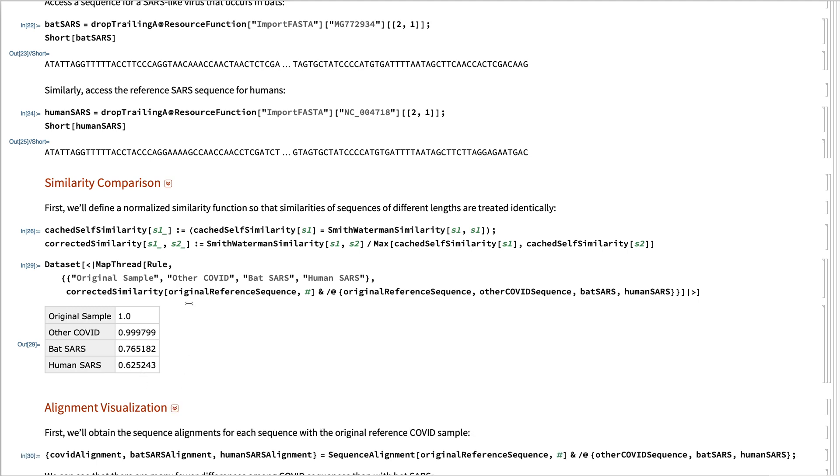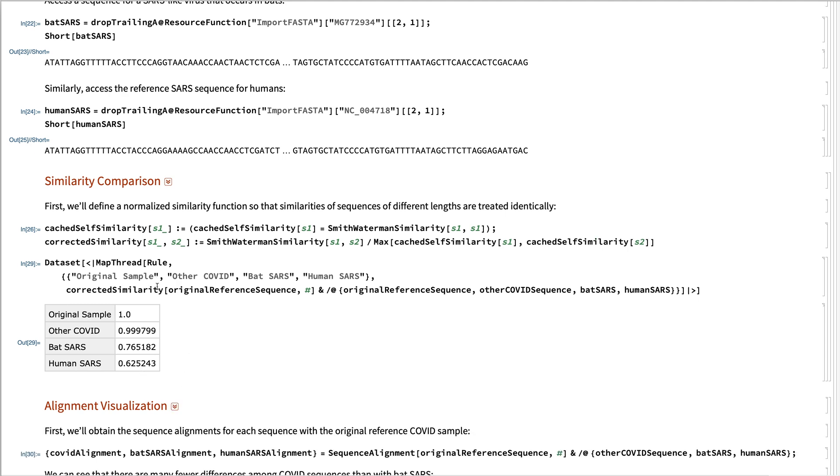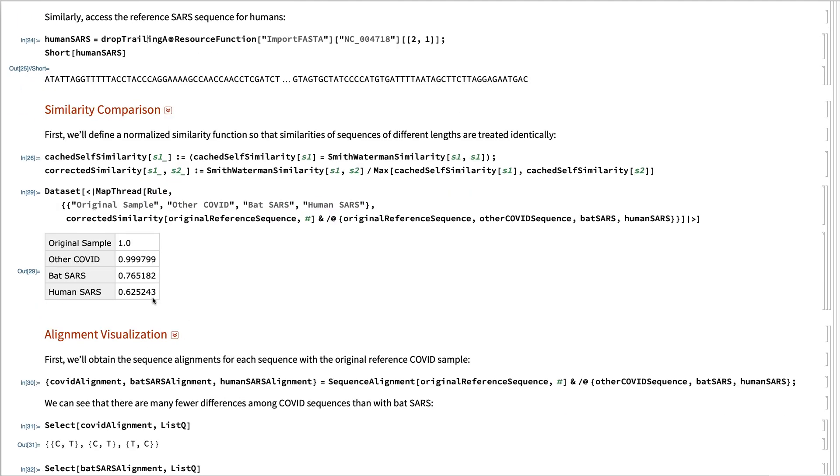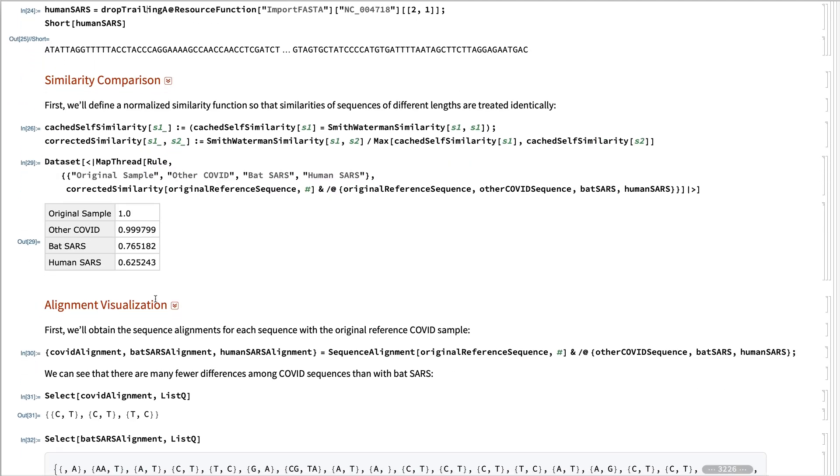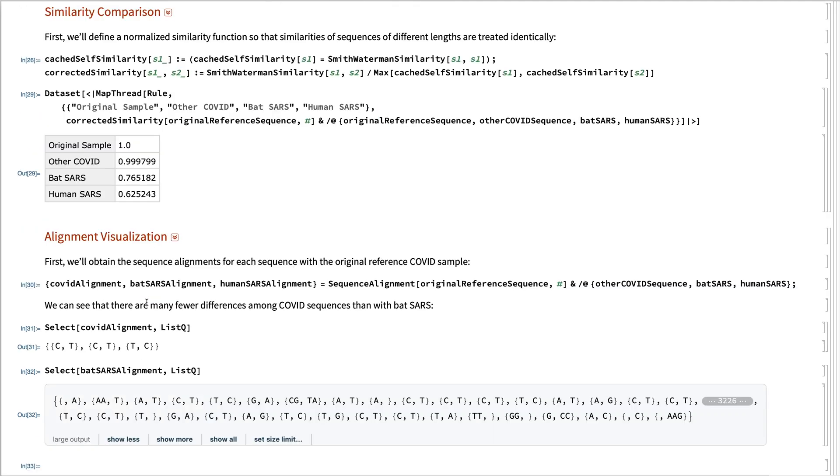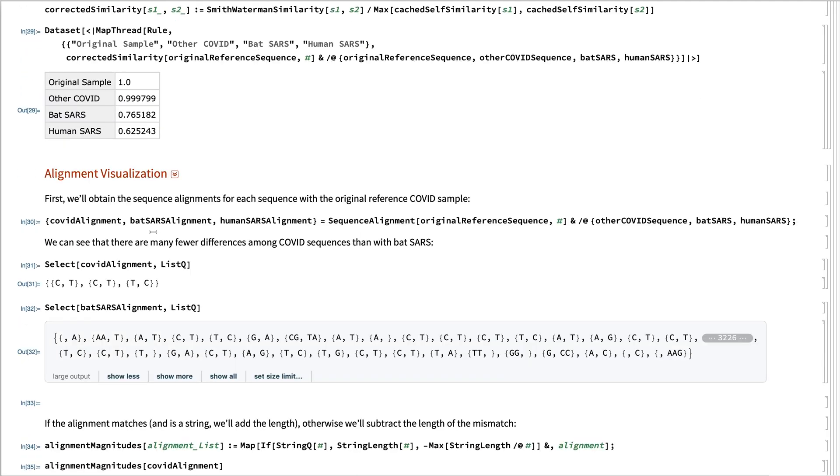So the bat virus is much closer as far as that goes. And we'll actually be able to see the difference here by we're going to align the original reference sequence to the other coronavirus.